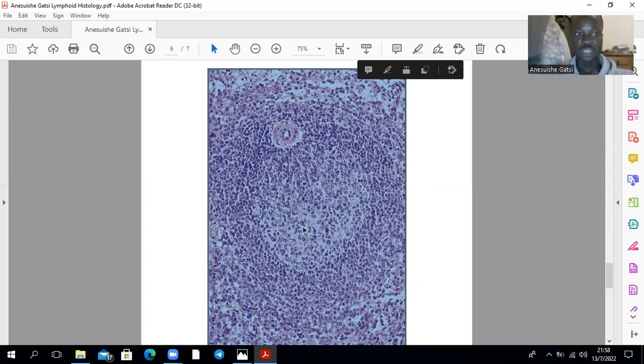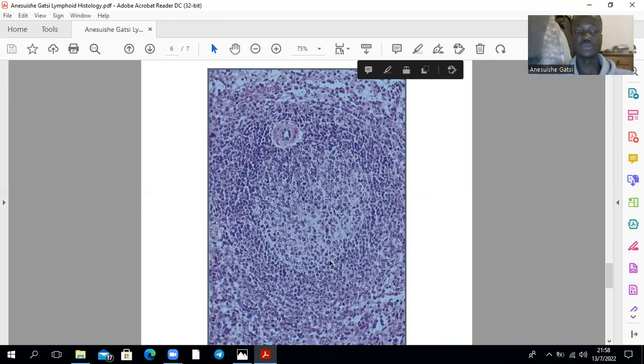And this is the germinal center, of course. And that marginal zone on the outside — your mantle layer or your coronal layer, whichever way you want to call it.